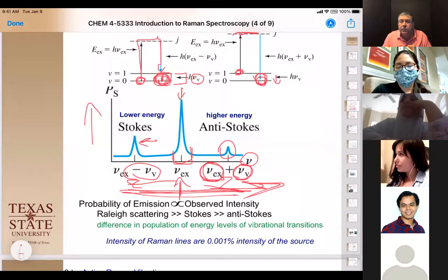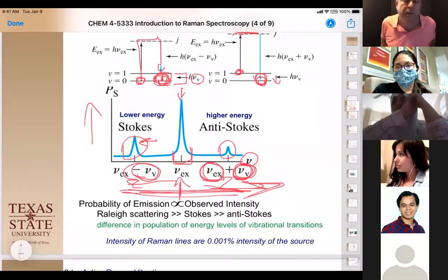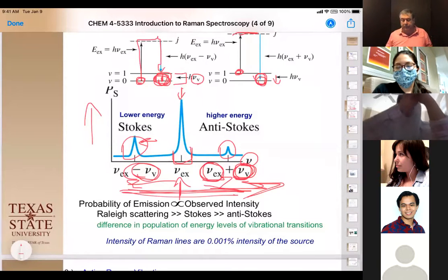It's essentially the source wavelength plus or minus a value. Yeah, and that delta value can be directly correlated to a wavelength in IR. So imagine that the plus here or the minus here is what you're actually going to see. In fact, most of the time, because the Stokes is more intense, usually they just do everything via the Stokes scanner.